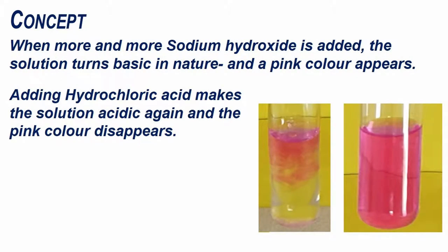When more and more sodium hydroxide is added, the solution turns basic in nature and a pink color appears. Adding hydrochloric acid makes the solution acidic again and the pink color disappears.